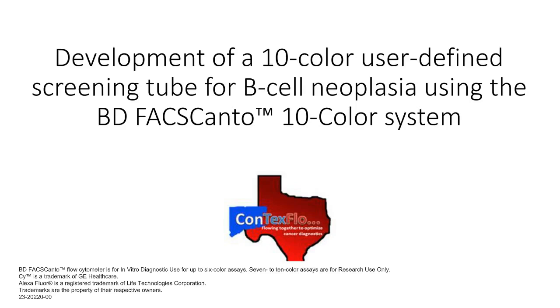Who wants to take that first? Yeah, so Bruce, the short answer is that we didn't really entertain that. From the simplest way to think about it, 45 was recommended in the Bethesda conference, and we didn't want to omit something that had already been in use and approved. And it was in the predicate tube. Having said that, I think your suggestion is a very interesting one. Even though we didn't really think about it or pursue it, it could certainly be tried.